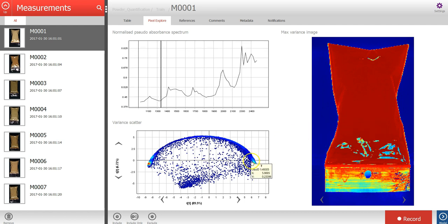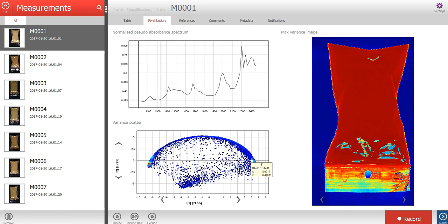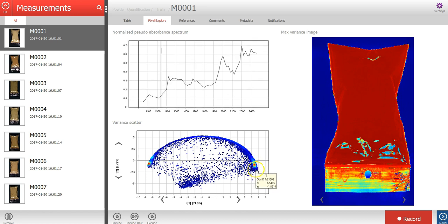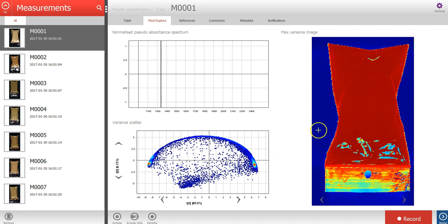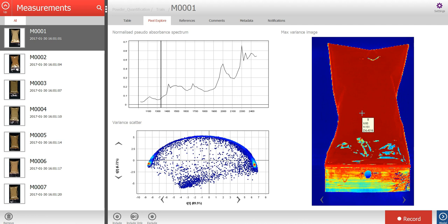Each point in the scatter plot corresponds to a pixel in the image. The points in the scatter plot are clustered based on their spectral similarity. The max variance image is colored by the variation in the first component of the PCA model.